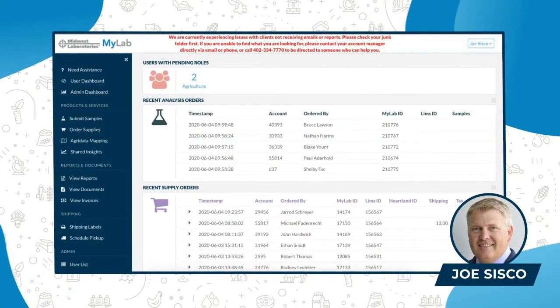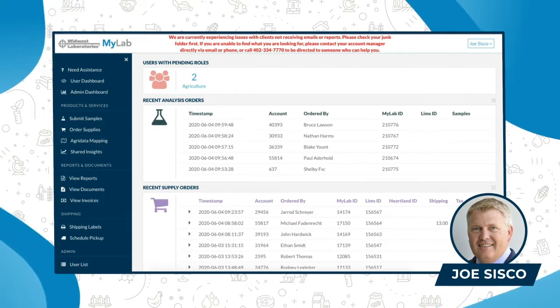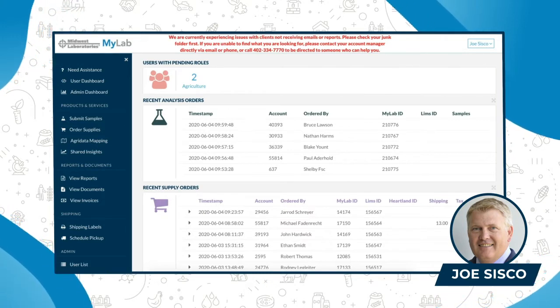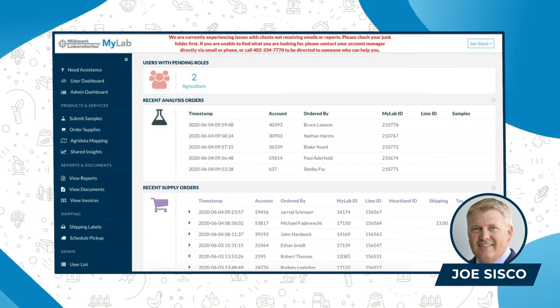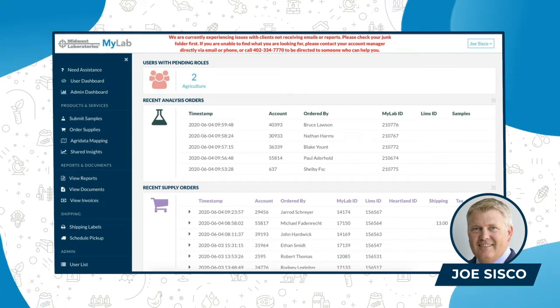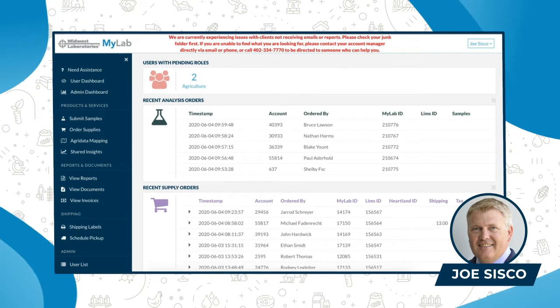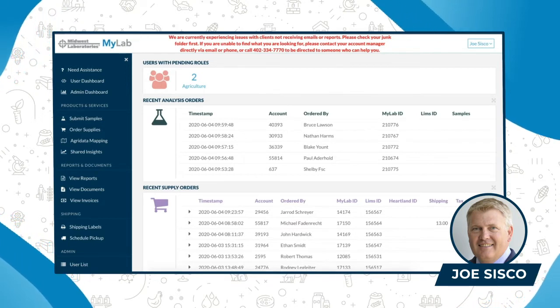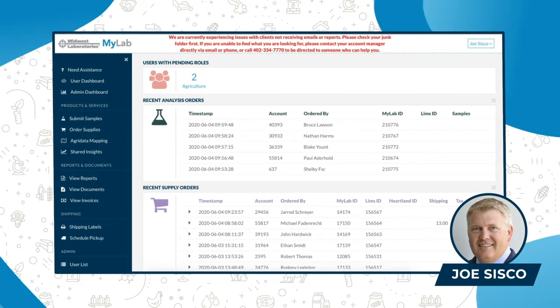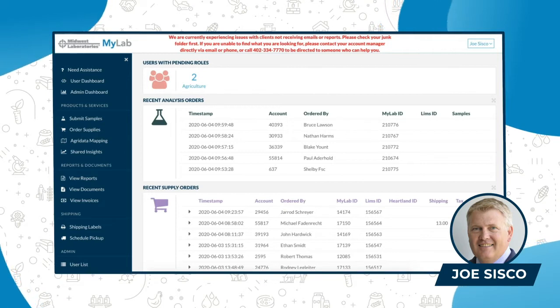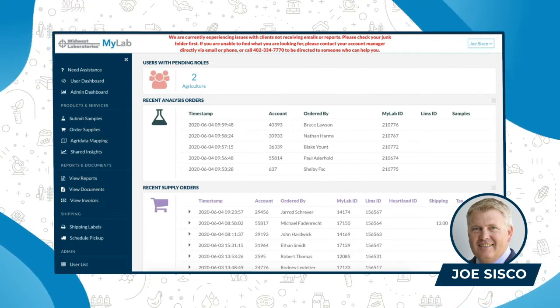Hello, this is Joe Sisko with Midwest Laboratories. Today I'm going to walk you through the submittal process for the Shared Insights program. We're going to take you through the submittal process to the point where you can actually print off a submittal sheet for your first, second, or third week of tissue sampling within the Shared Insights program.